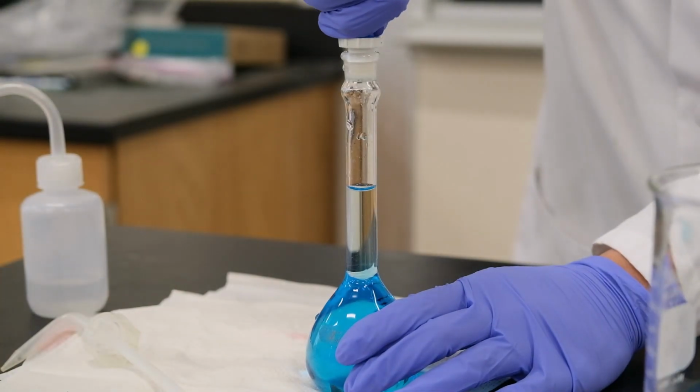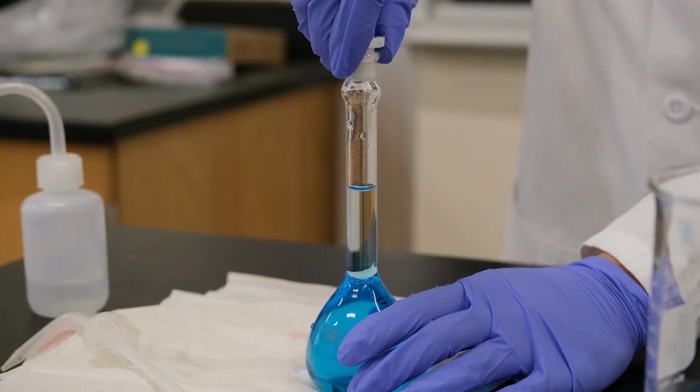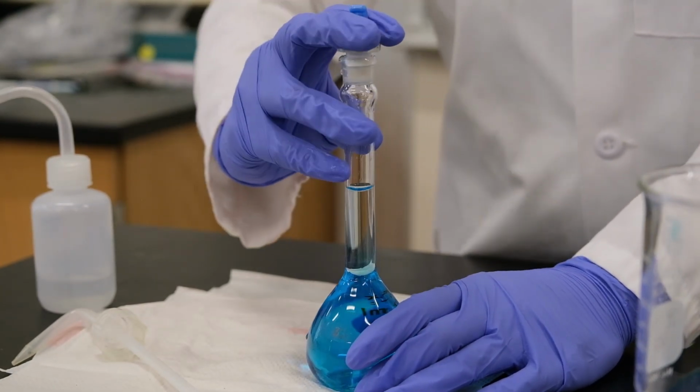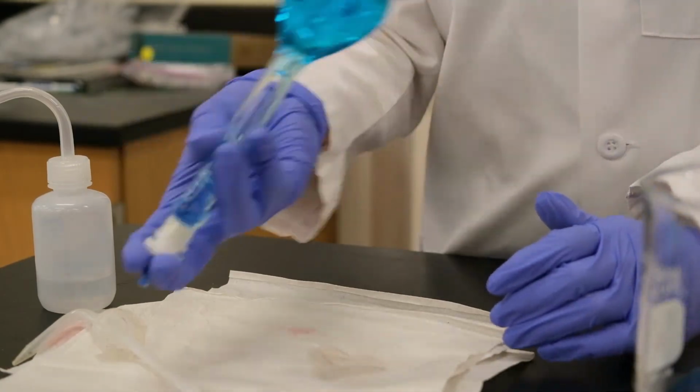Once we've added the deionized water, we're going to put the stopper and mix it 10 times.